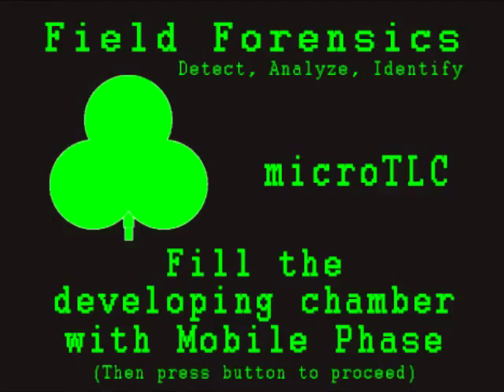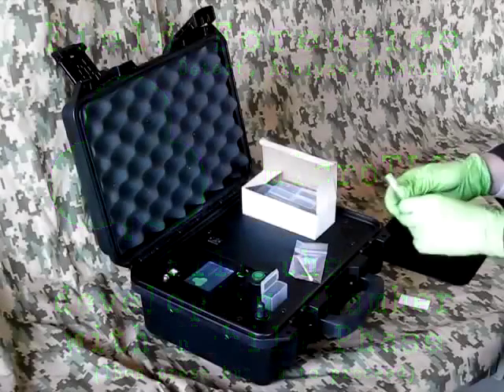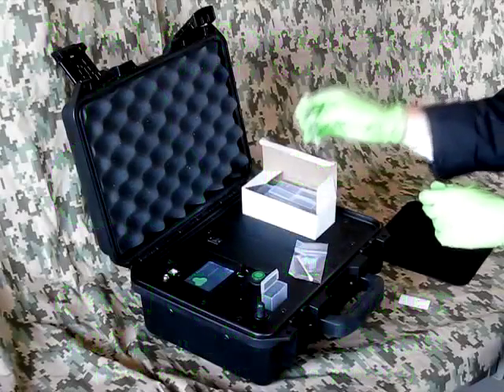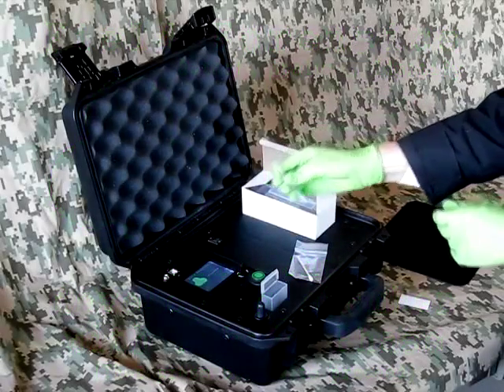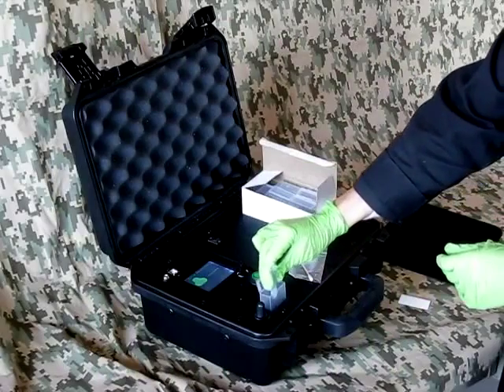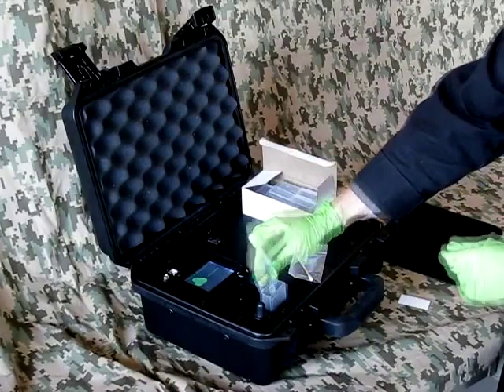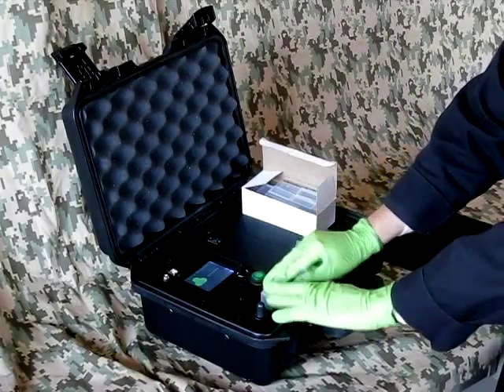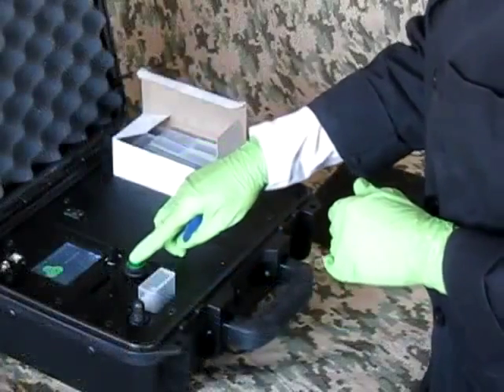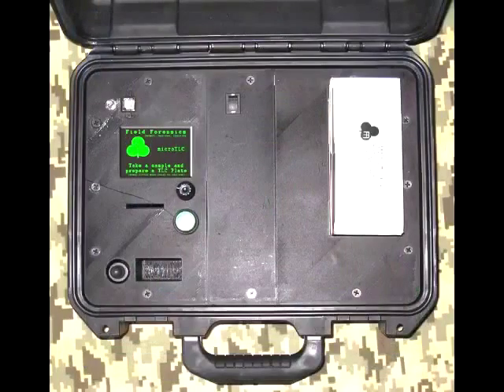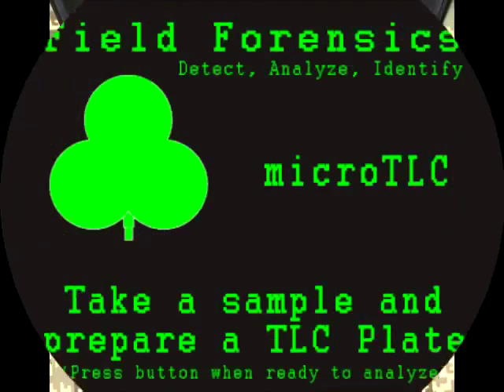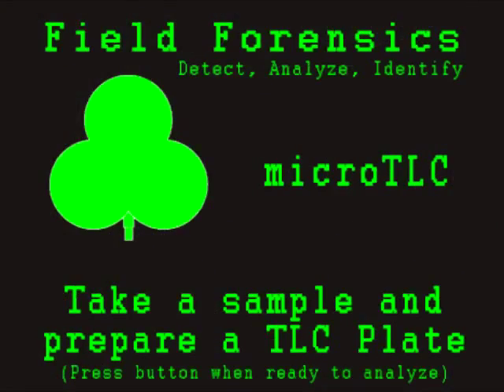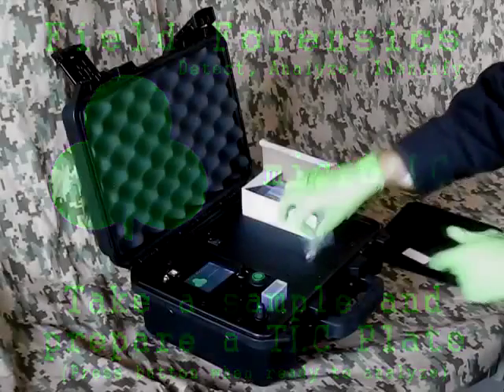Next, fill the developing chamber with mobile phase. Break the ampoule in the pen and squeeze the mobile phase into the chamber. Close the chamber and allow it to equilibrate while you prepare the sample and the TLC plate.